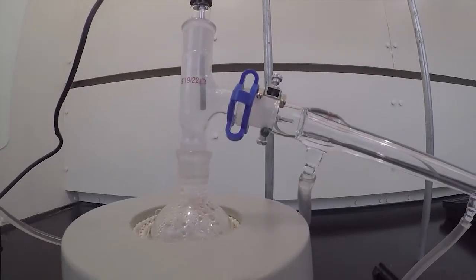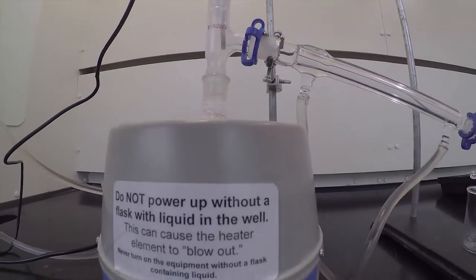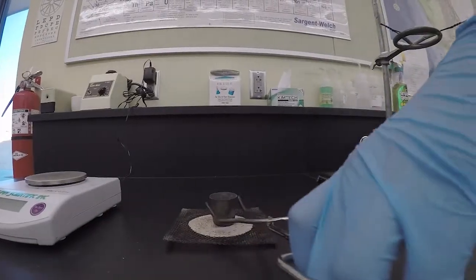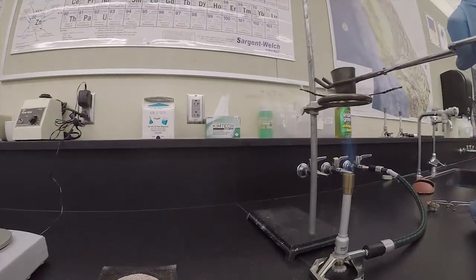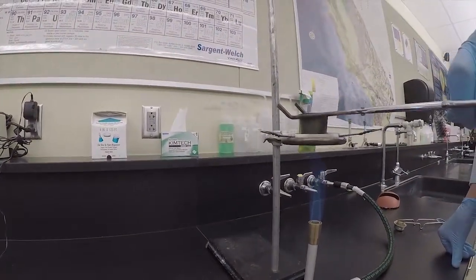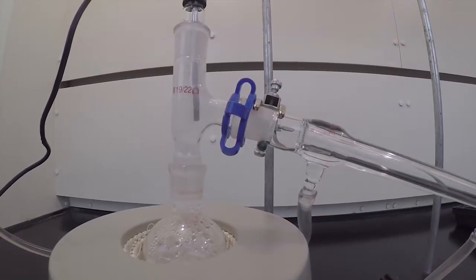When heating glassware on a hot plate or Bunsen burner, remember to have a liquid inside to absorb the heat. Make it a habit to handle items such as hot crucibles or glassware with your provided hot mitts or tongs. Ask yourself this: does glass look hot when it is hot? Always proceed with caution. Also, let your glassware cool down slowly.